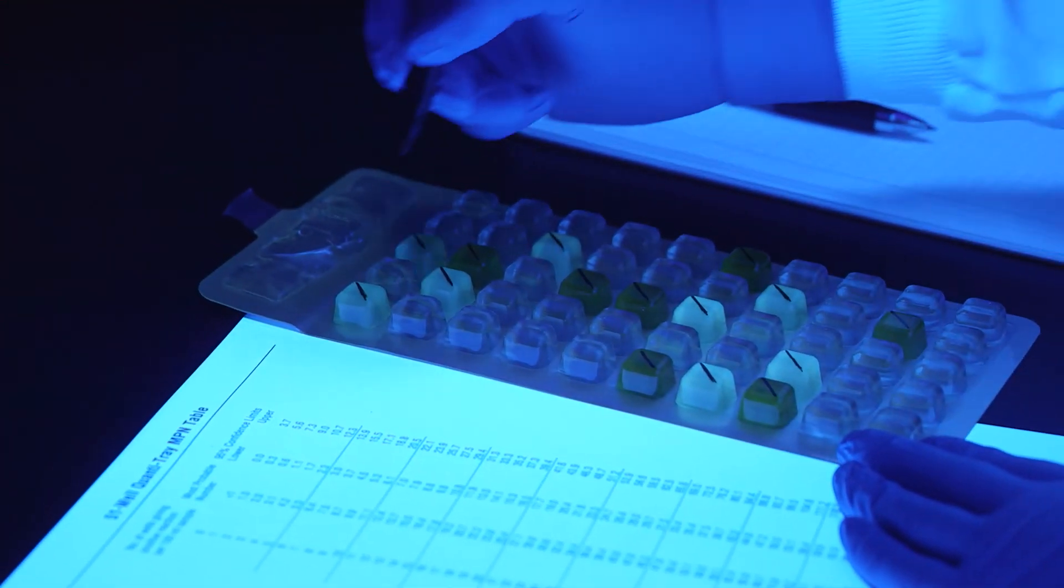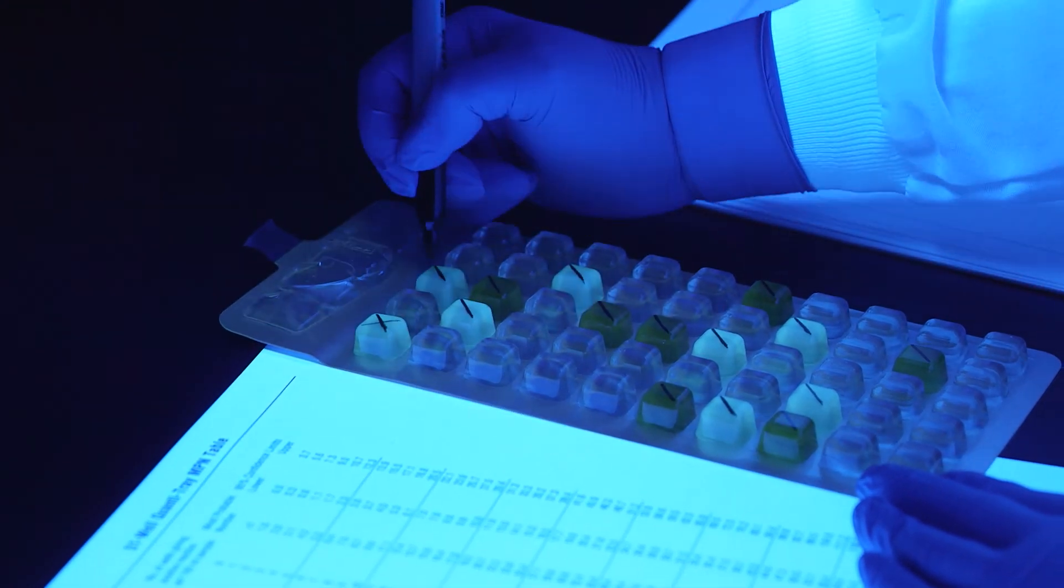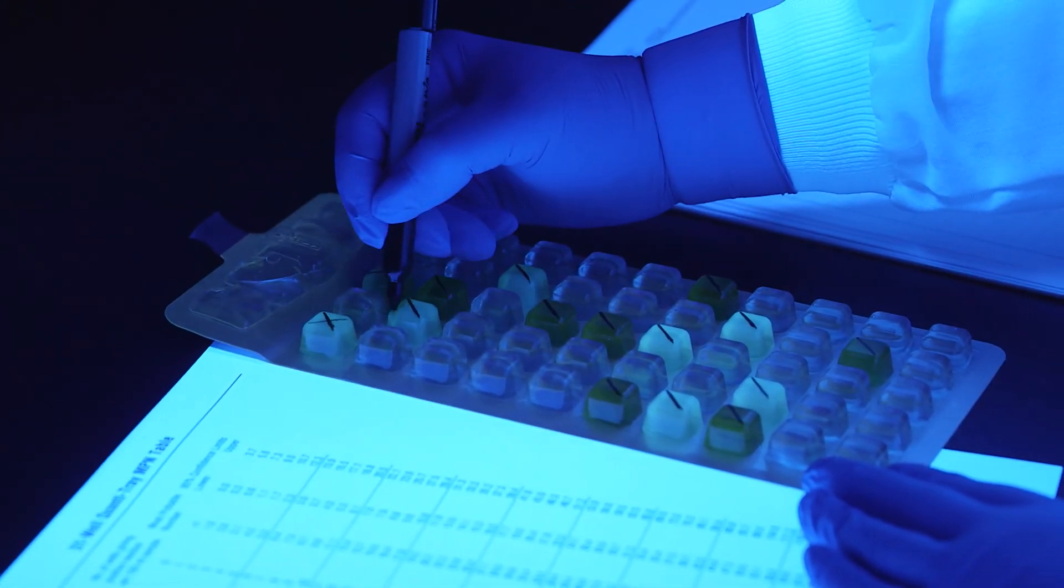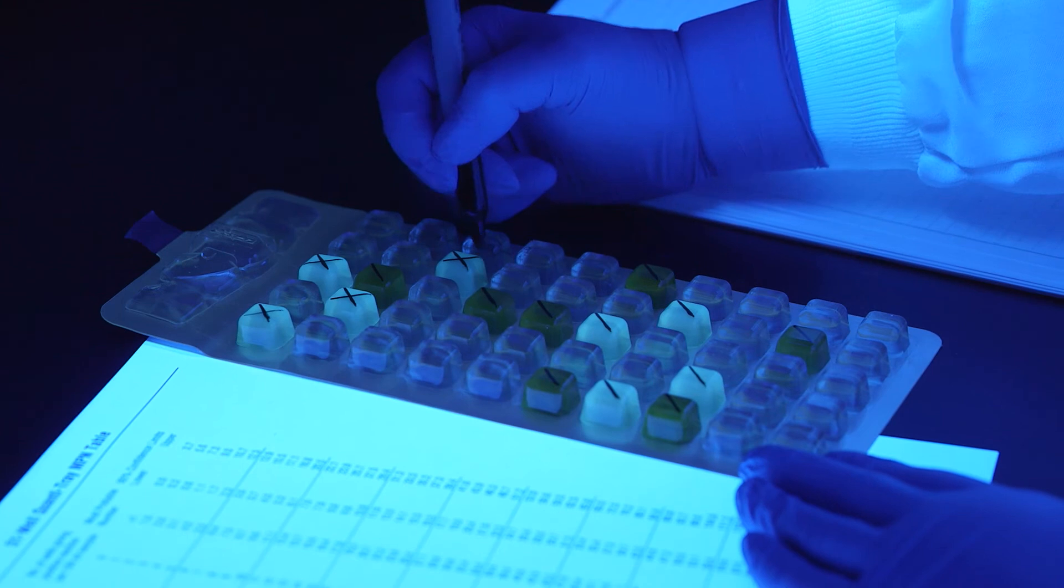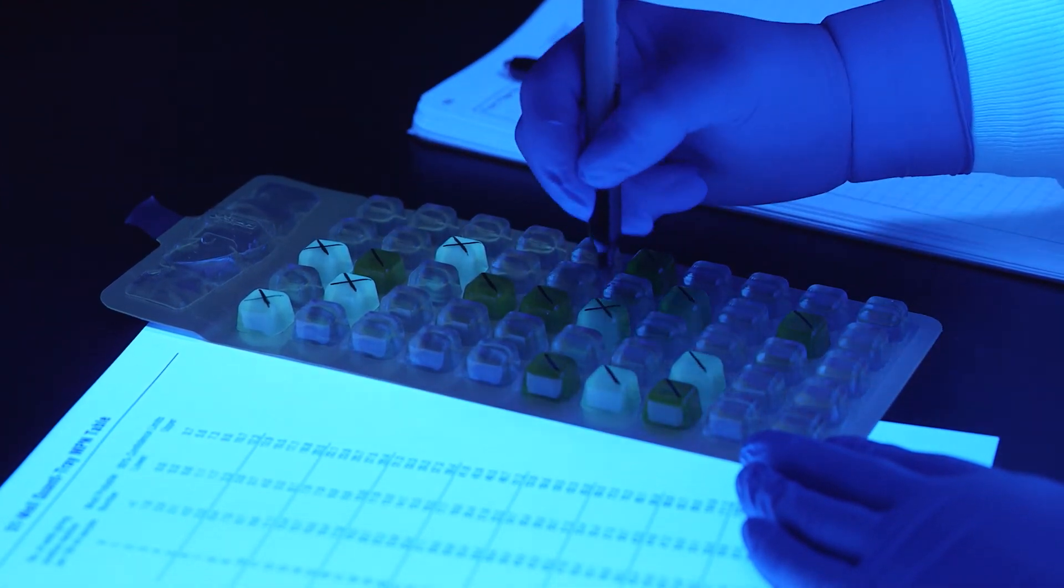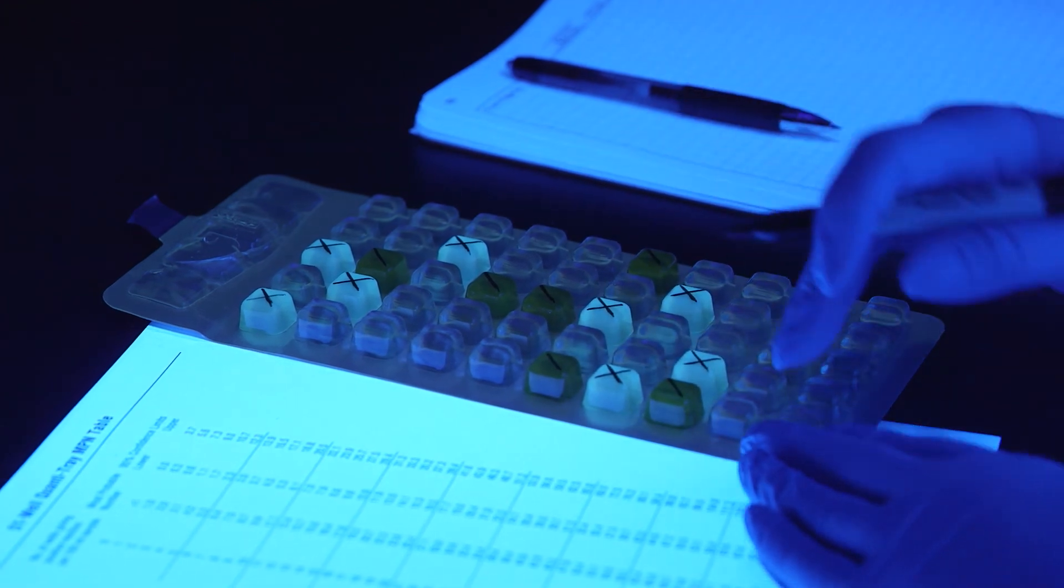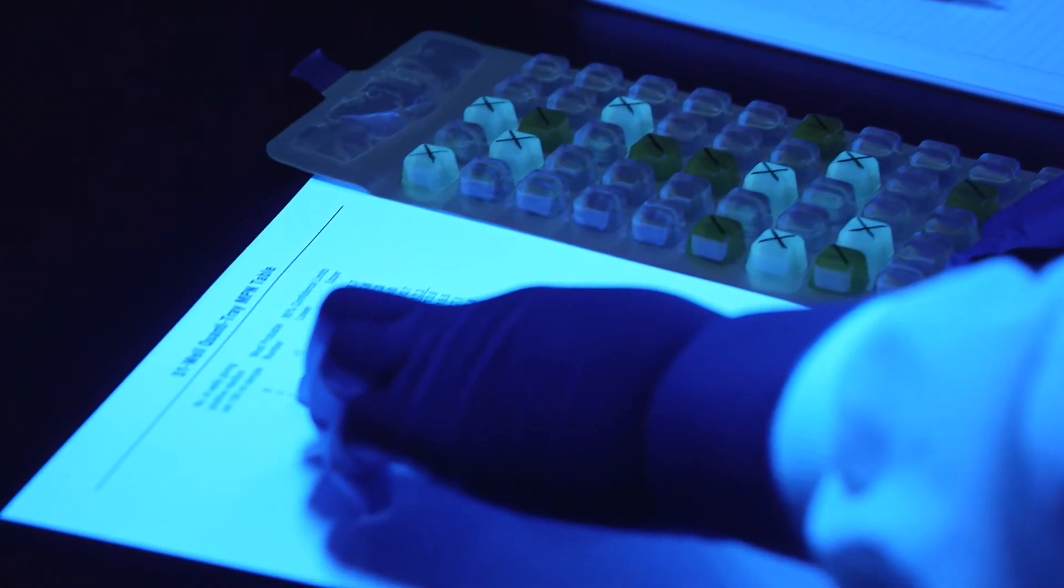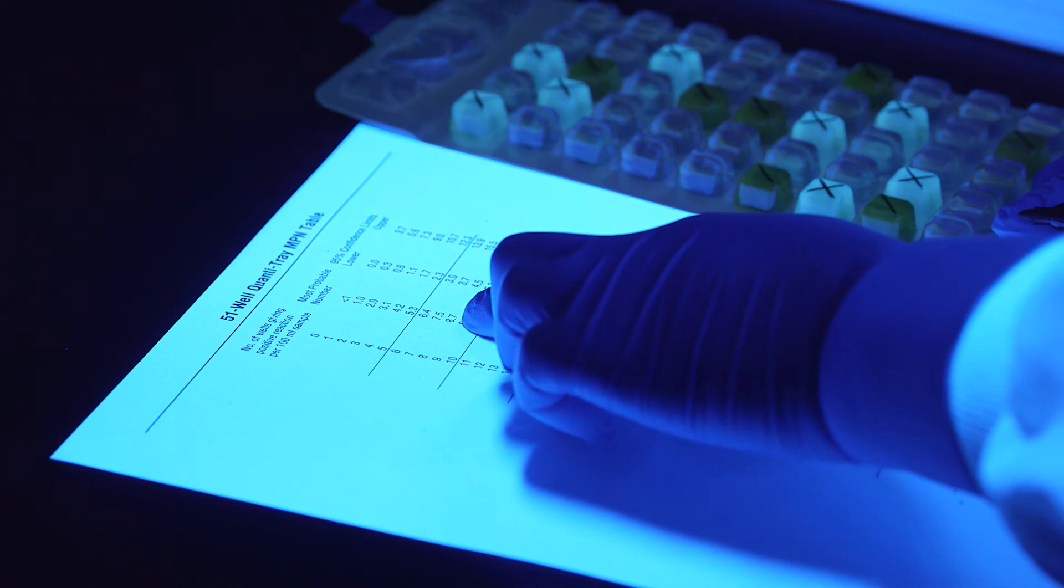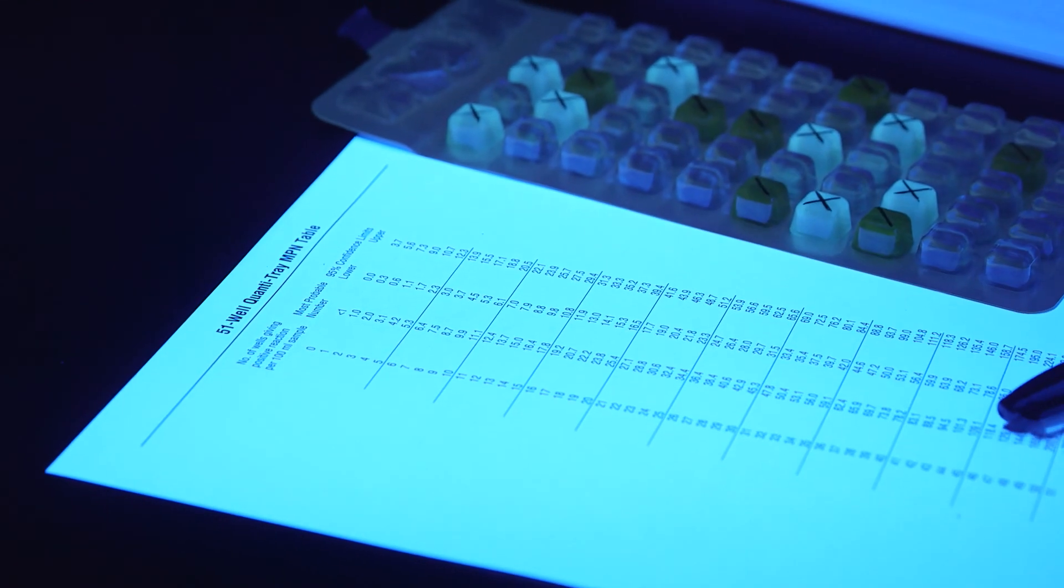To determine the number of E. coli view the Quantitray with a UV lamp in a dark environment shining the light away from your eyes. Keep the light within 5 inches of the tray, count the fluorescent wells that are equal to or greater than the comparator and then refer to the MPN table. The most probable number of E. coli for this example is 8.7 per 100ml.